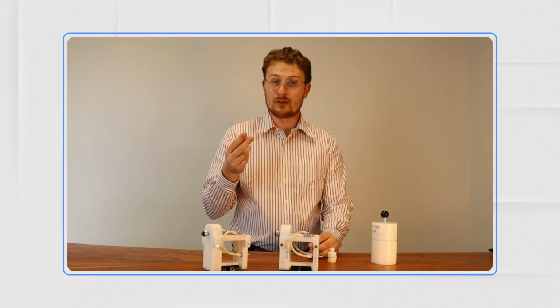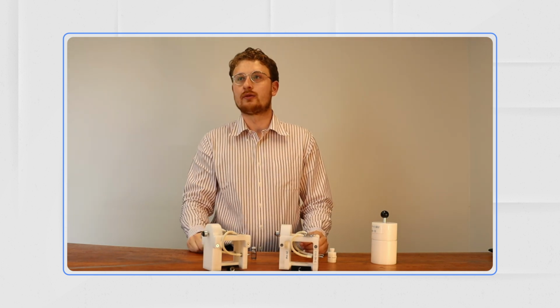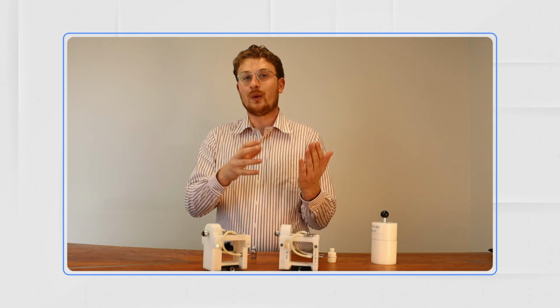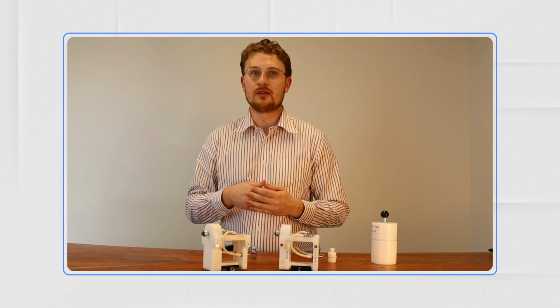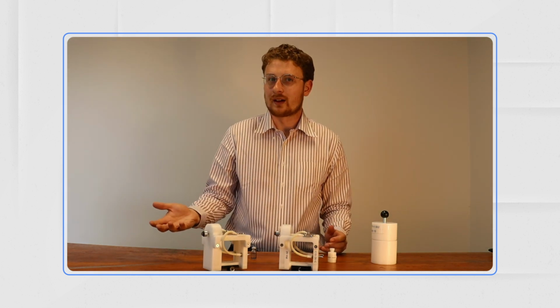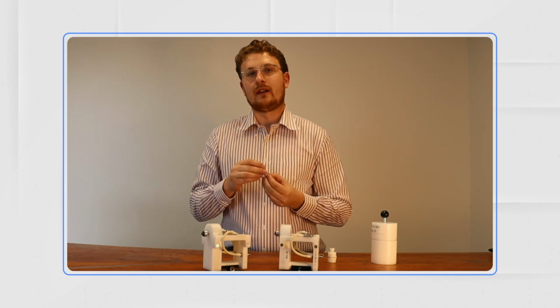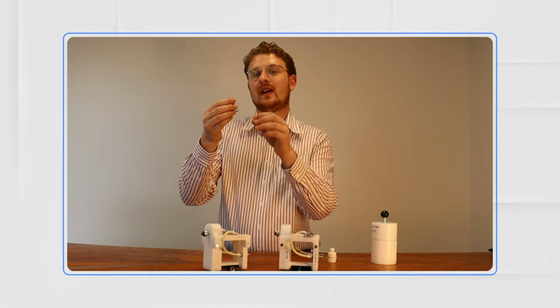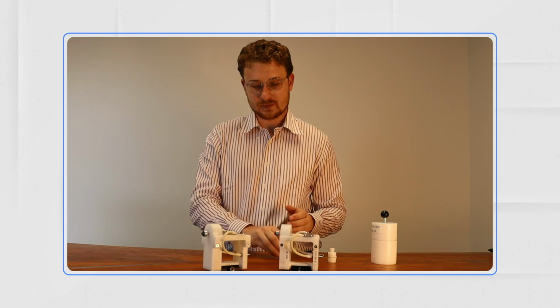The thing that made this difficult is that the product inside is embolic fluid, which means that it is related to the chemicals in our blood that are responsible for coagulation and stopping up bleeds when they happen and preventing you from bleeding more. AKA, it's very thick and it likes to clog. So we knew that any defects under the fill line were going to have difficulties with clogging, as that same coagulating effect happens as we try to pull the liquid out of any laser drilled defect sites.